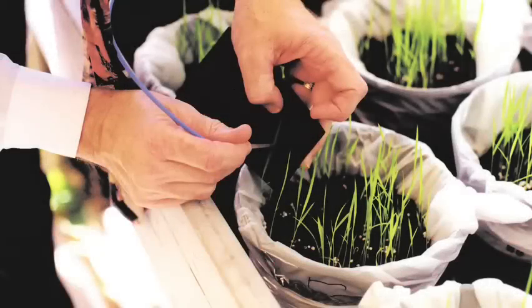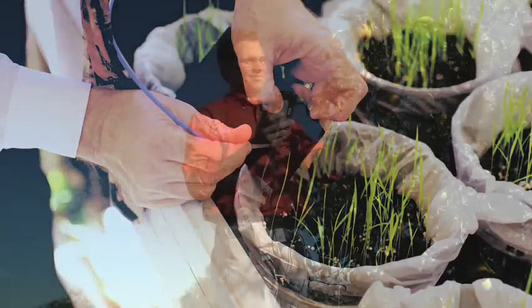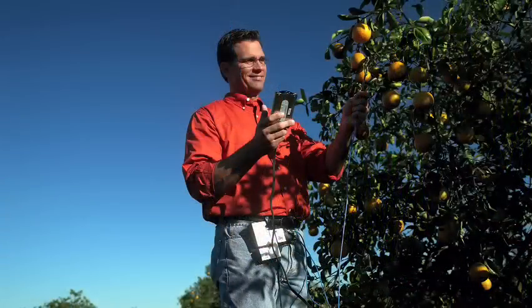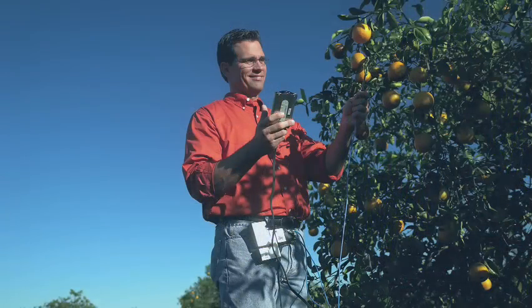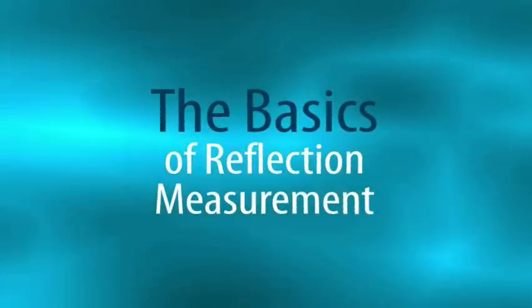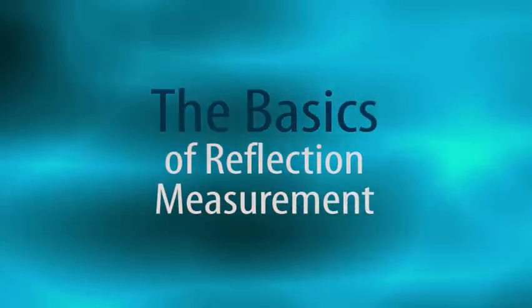In this tutorial, we'll illustrate the basics of taking a reflection measurement using SpectraSuite software from OceanOptics. For more information on installing SpectraSuite, be sure to visit our website at OceanOptics.com.